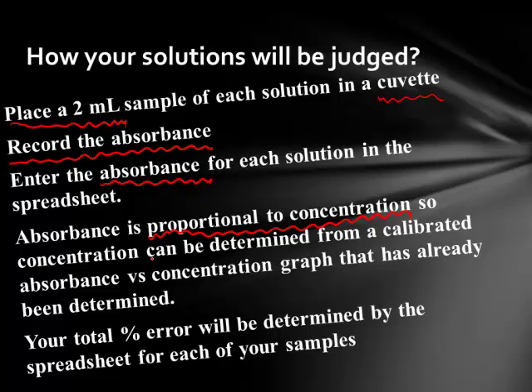So we can determine the concentration from a calibrated absorbance versus concentration graph. And we've made one of those.